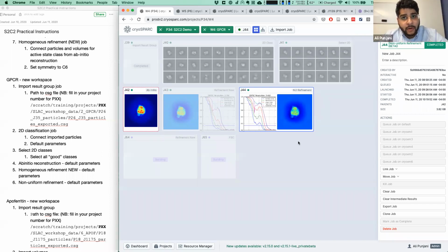In my experience so far, I haven't found anything like that. It's not a question that I've actively explored, but I don't think you would expect there to be anything, mostly because the purpose of non-uniform refinement, and actually this makes it kind of bad for a practical tutorial, is to remove the necessity to tune any parameters or make any decisions about the protein or its regularization. So whether you have a nanodisc or a micelle, the algorithm itself will self-optimize its regularization scheme against the data through the cross-validation method that we used. And it will do something different in both cases by itself. Not something that you have to manually choose.